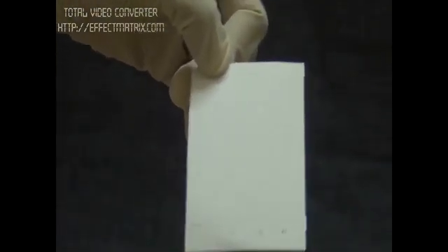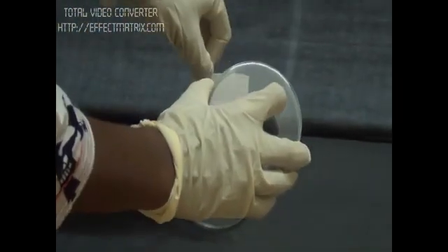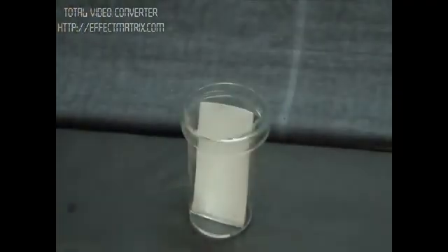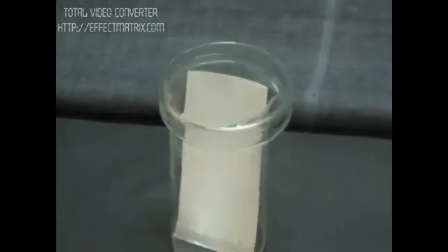Now we are ready to place the plate into the solvent system. This solvent system contains butanol, acetic acid, water in the ratio of 8:2:2. On the basis of affinity towards water, butanol and acetic acid, the amino acids will separate.